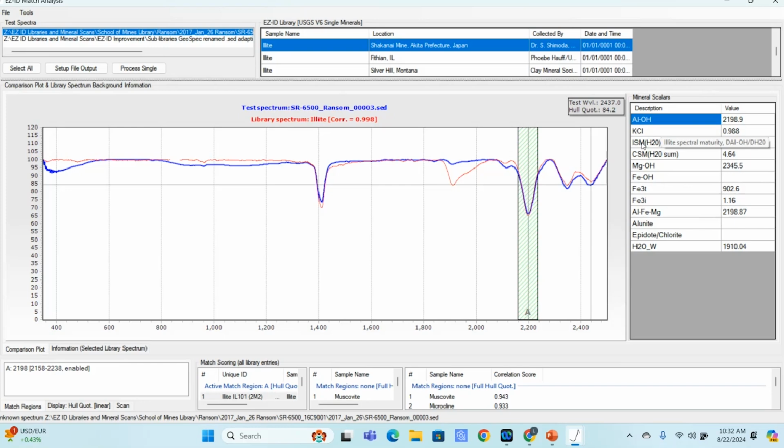It's done by detecting the mineralogy and reporting this scalar. For example, smectites will convert into illites with increasing metamorphic grade, and these are then converted to muscovite and other true micas. So those subtle geothermal trends are easily detected within these white micas, and they can be mapped with this scalar.